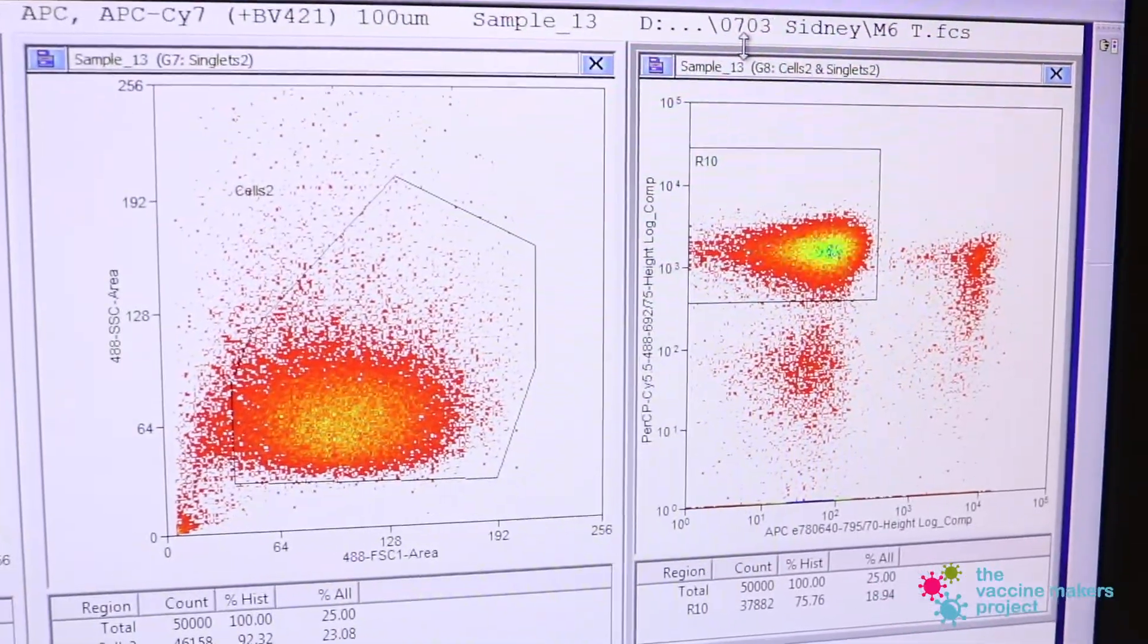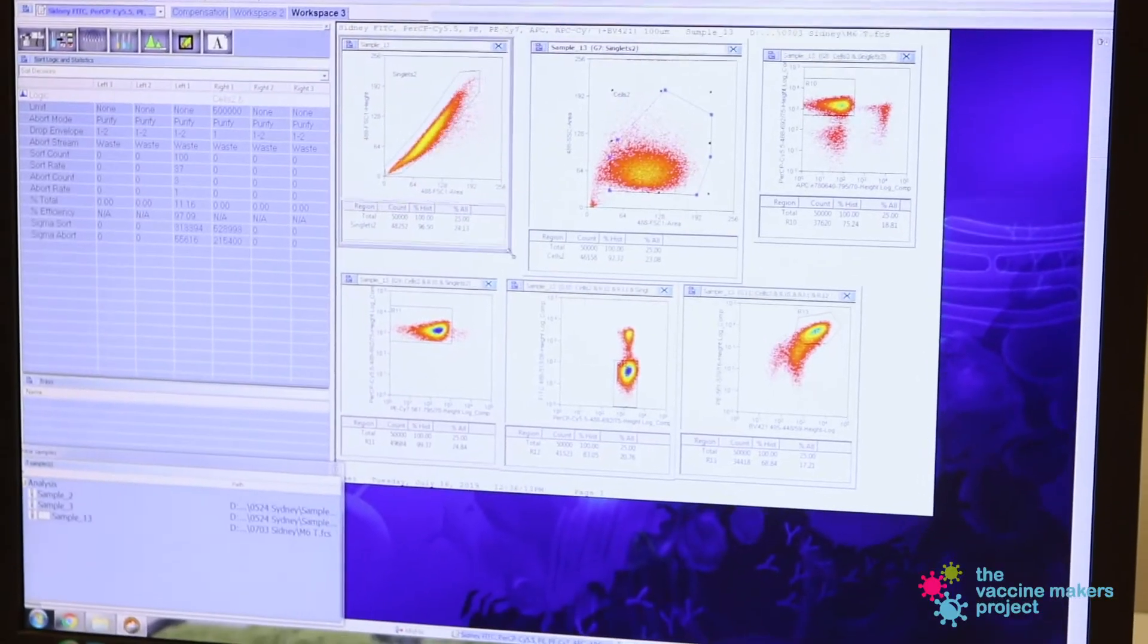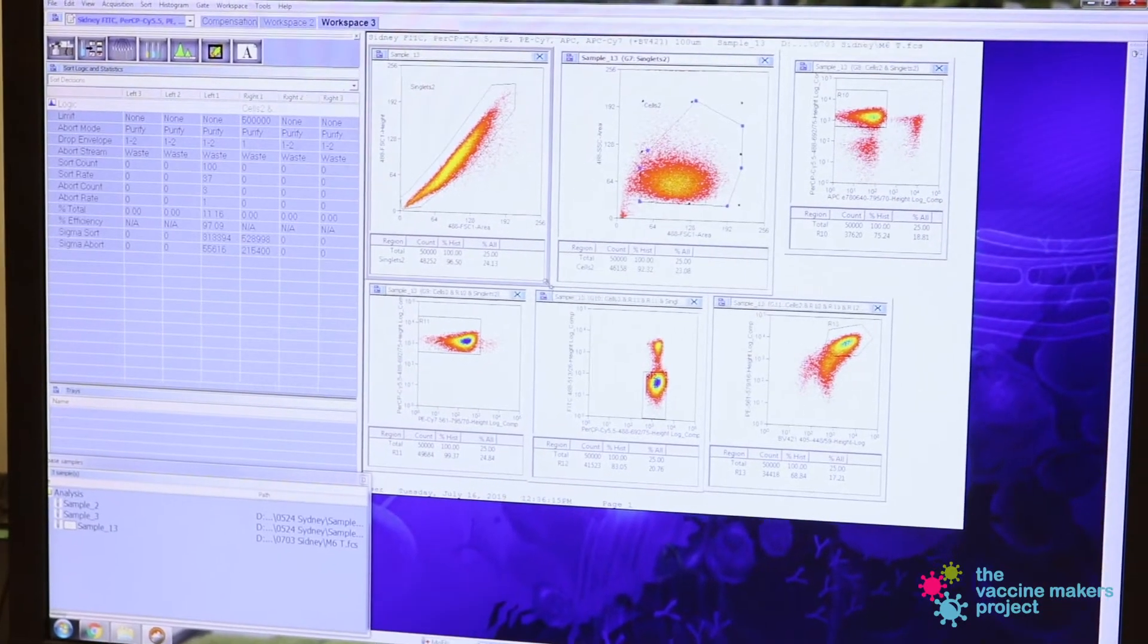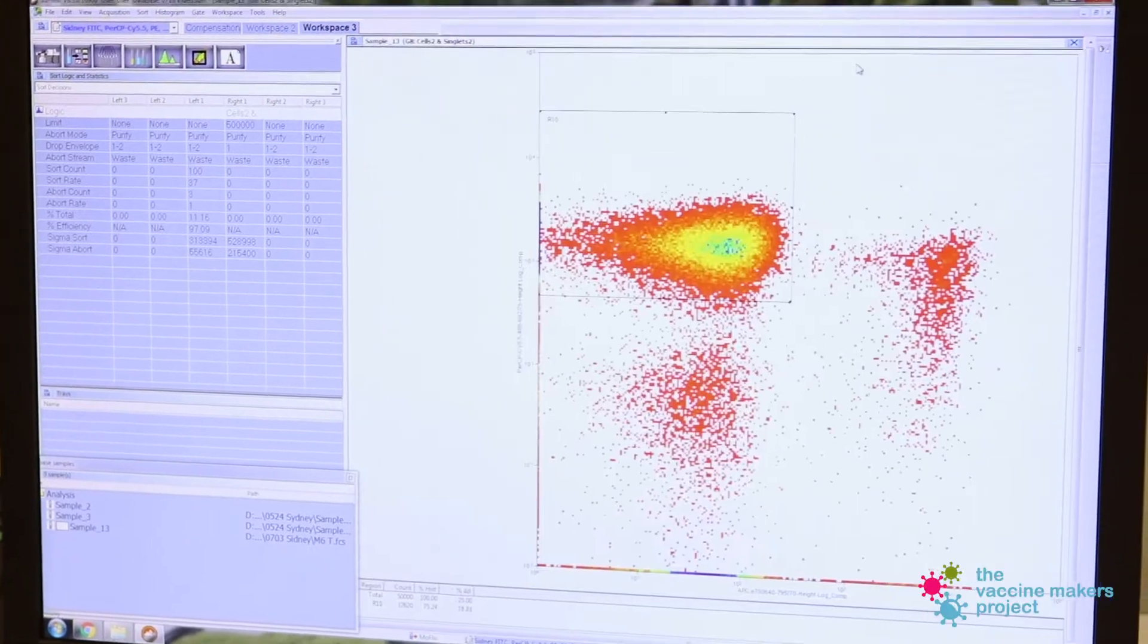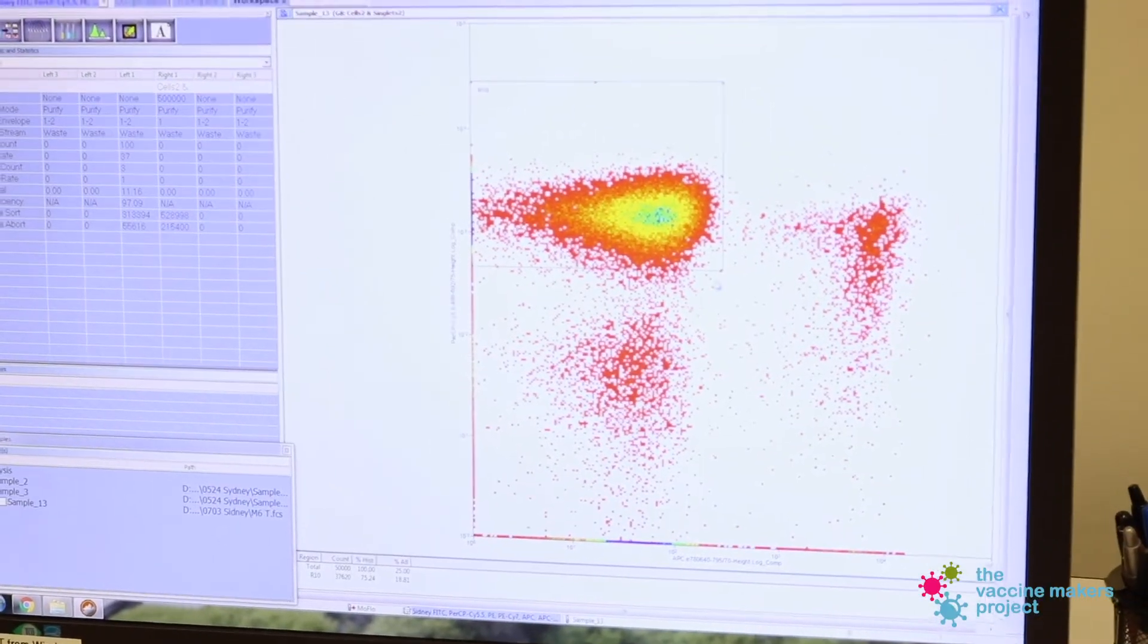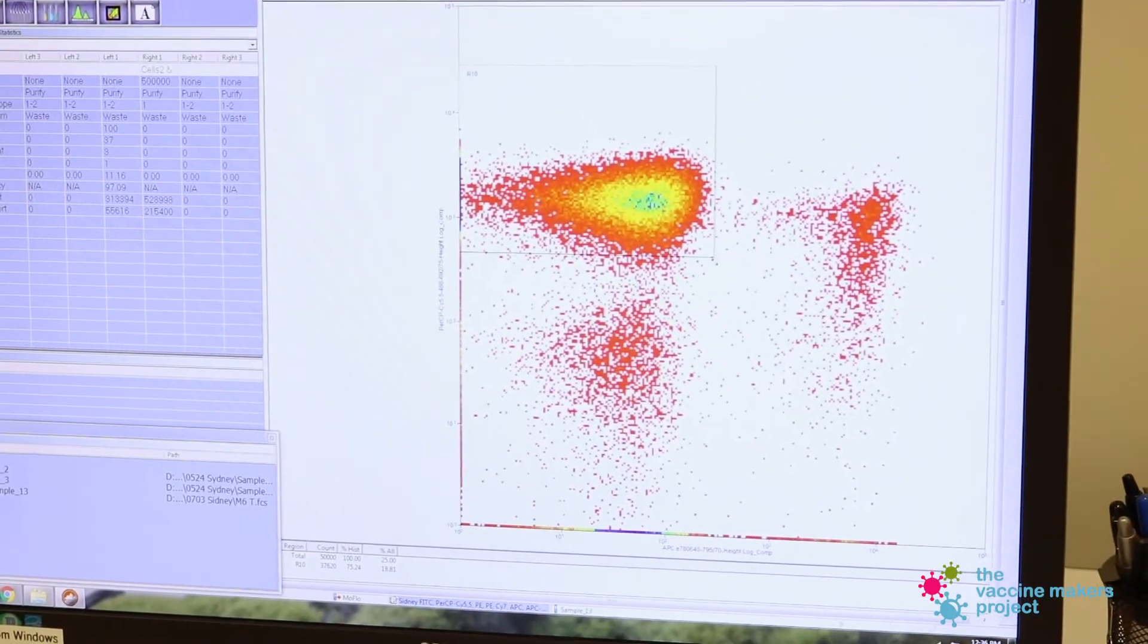The forward scatter of light, or what shines straight through the cell, enables scientists to measure its size. The side scatter of light, or what shines through the cell at an angle, indicates the complexity of the cell by measuring the scattered light.